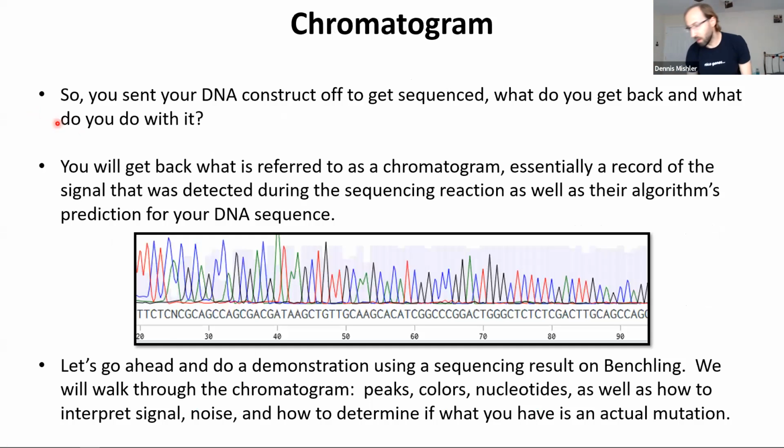Okay, great. So with that, that is how the process works in a very simplistic fashion, right? So you're going to basically take this primer, you add it, you have modified nucleotides, and these nucleotides contain some signal that can be read, and they do chain termination. So they go until they hit the right nucleotide, it stops, and that gives you a signal that tells you which base was present. And so you can use a ratio of a mixture of chain terminating nucleotides and chain continuing nucleotides so that you can see the entire sequence.